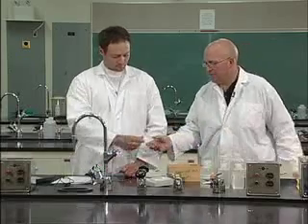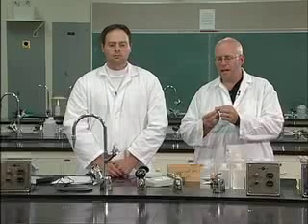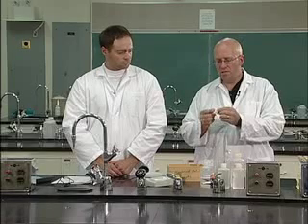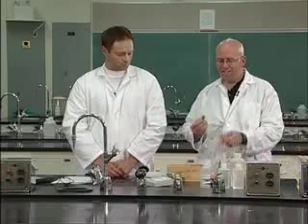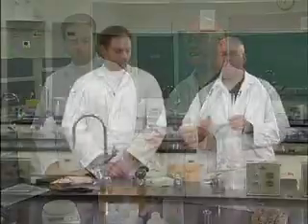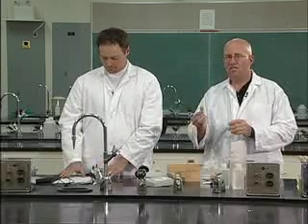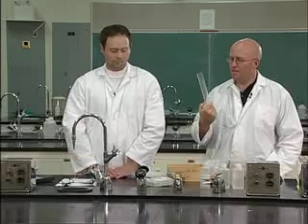Well, let me grab that thing. You can take this thing, and if you remember your grade 9 math, you can figure out the volume of this by doing volume equals pi r squared h and all that kind of fun stuff. But in chemistry, we have access to other volume methods, and it's a whole lot more fun finding the volume this way, and usually fairly simple. So I'm going to have Scott figure out the volume of this sample using only a graduated cylinder.